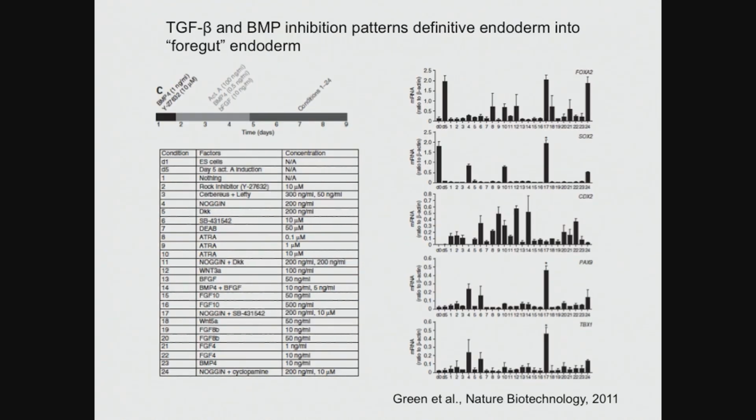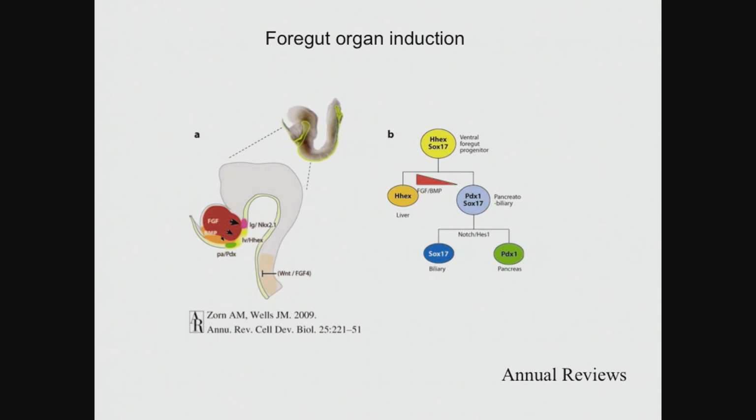How do we do this for lung? When the first few papers came out using embryonic stem cells and reporting that they were detecting some expression of lung epithelial cells, they were very stochastic, just leaving cells to differentiate somewhat randomly in non-specific medias. As the field progressed to really trying to deliberately pattern these cells stage-specifically, there was a roadblock.